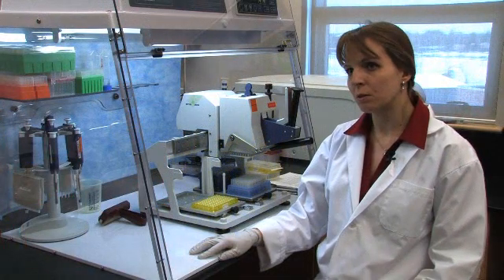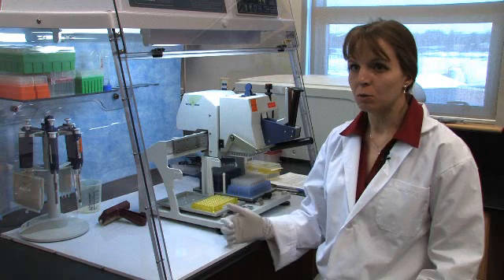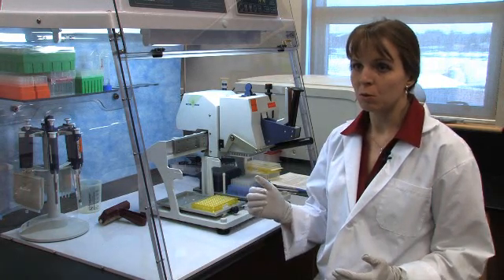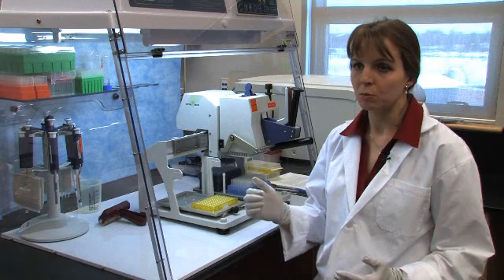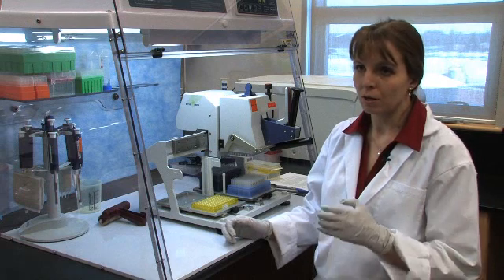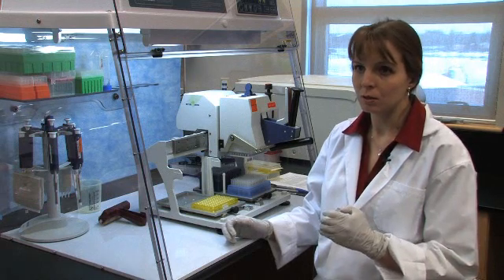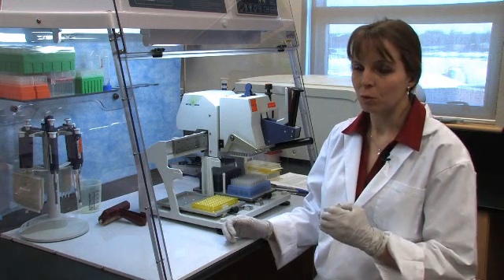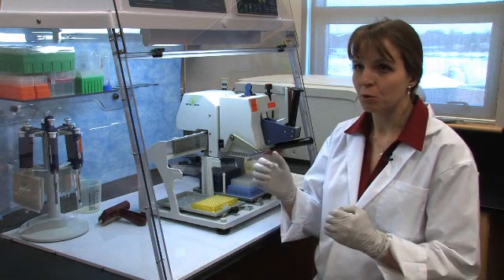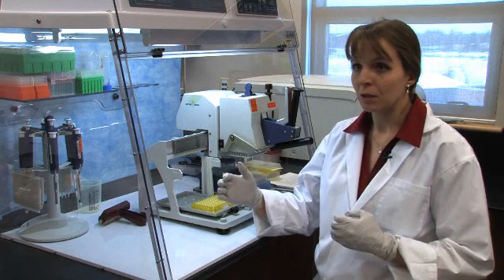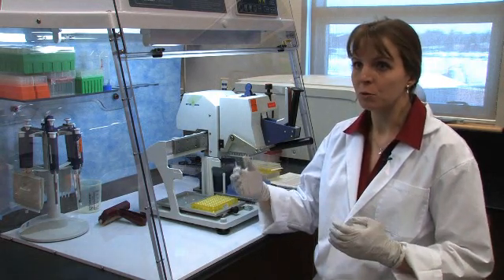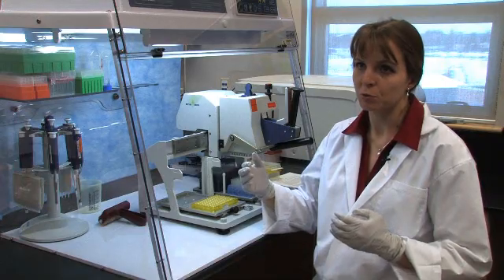The advantage of using liquidator is that it allows you to control the speed because it allows really slow aspiration and really slow dispense. Liquidator is really flexible. It allows you to hold the handle with one hand without dispensing the blowout volume, while with the second hand, you can change the volume, which will allow you to move to the next step in a single motion without interruption of the process and introducing any bubbles and cross-contaminations between samples.